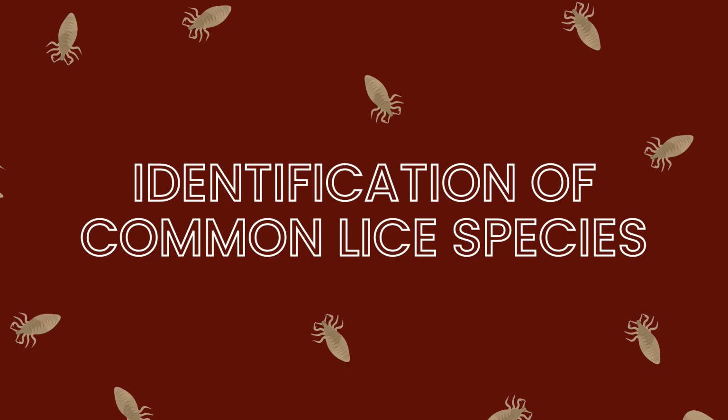In this activity, we were tasked to bring 3 species of lice, each from different animal hosts. Moreover, we were also tasked to draw and label accordingly the external anatomy of the lice. Guide questions were also given for our answers and illustrations. Then, during the activity, we were advised to take photos and video clips that will be included in our video presentation by group as a form of documentation.